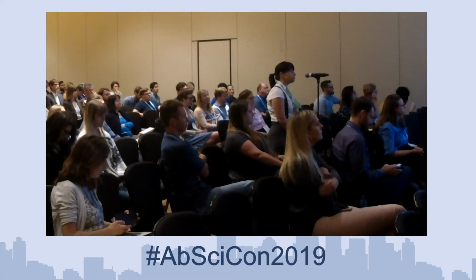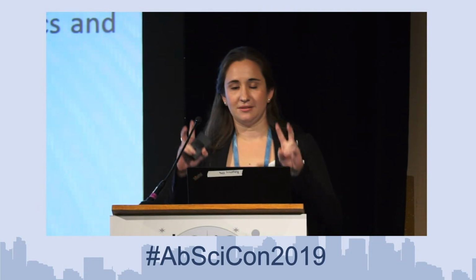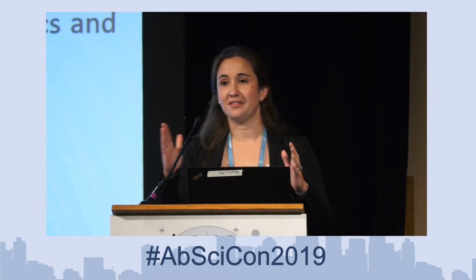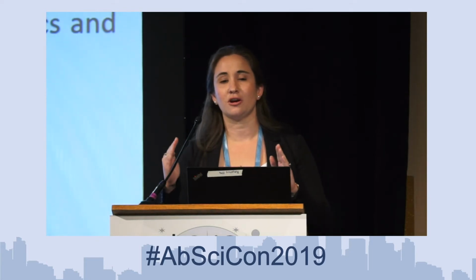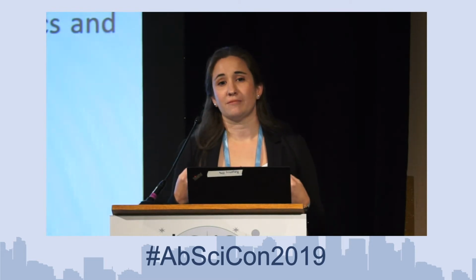Yeah, so it has to do with basically the speed with which they move. The method that detects them but doesn't separate them is because, well, actually I'm not sure it would even measure glycine. They all just move so fast under that, because in addition to separating based on charge and size, when you apply the electric field, you also get what's called an electroosmotic flow.